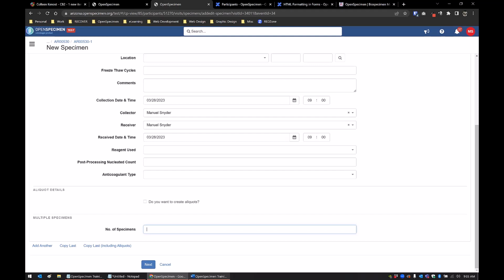The only issue with that is one, it could be PHI, most likely it's PHI, but the other thing is that we repurposed a lot of fields in tissue metrics. So some of the backend labels for the fields aren't what the actual data is. For example, in the front end of tissue metrics, the participant ID or an external PTID is actually stored in a field called species.